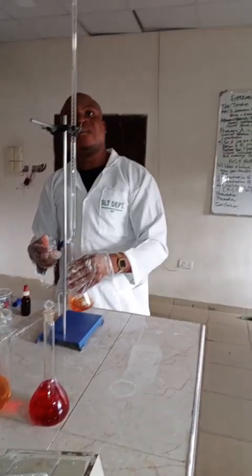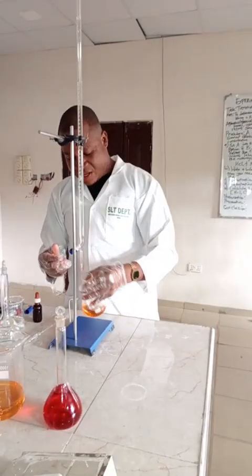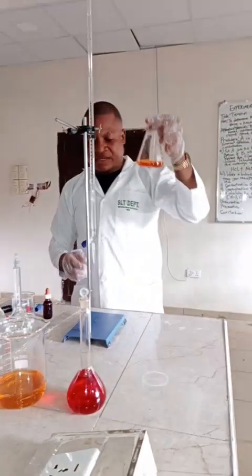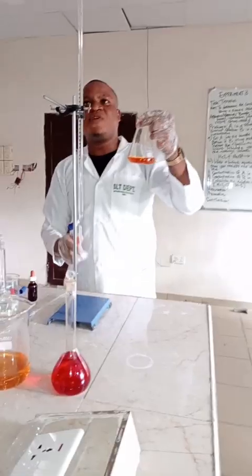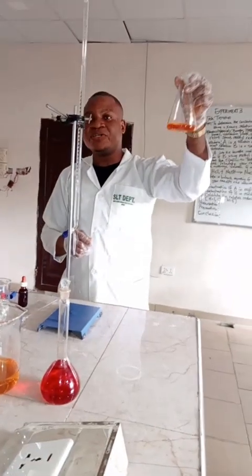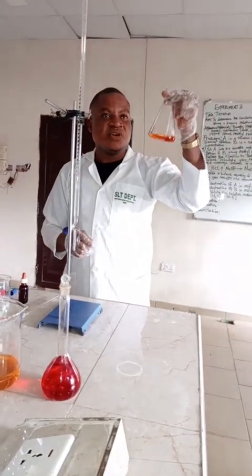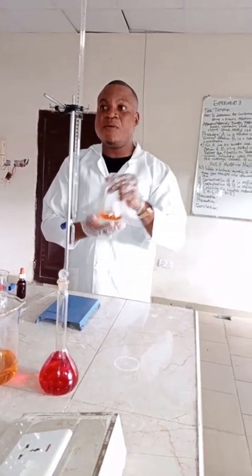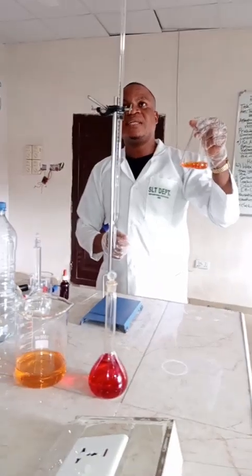Now, from the titration, there's already a change in color. This is our endpoint, quite different from what we had at the start. There is a color change. It shows that neutralization has taken place. Are you following?